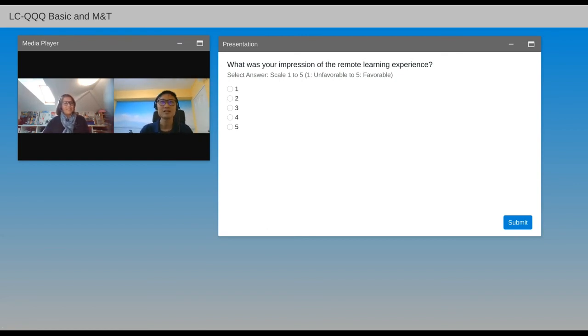Yes, I think that there might be a thinking that for LC Triple Quad, since it's going to be more targeted analysis, a lot of times it will be more through manual optimization or even through using our optimizer software, which is pretty good. However, Agilent does offer databases for certain applications, for example, in the forensics field or in the toxicology area. So these are actually triggered MRM's so-called database.